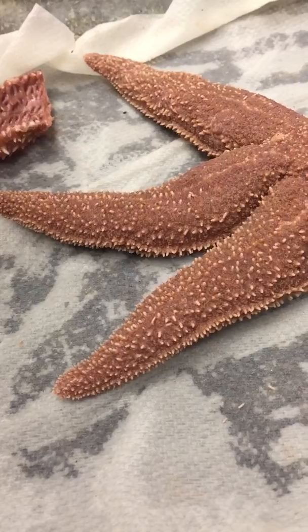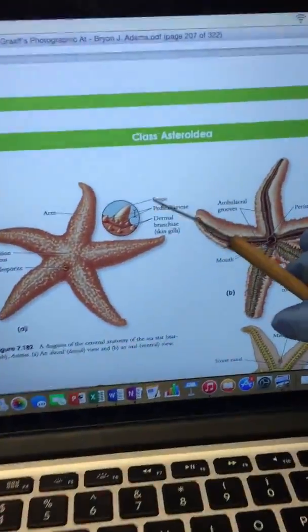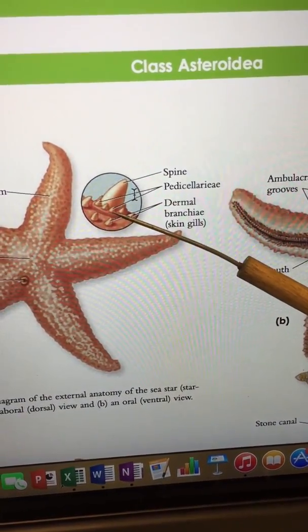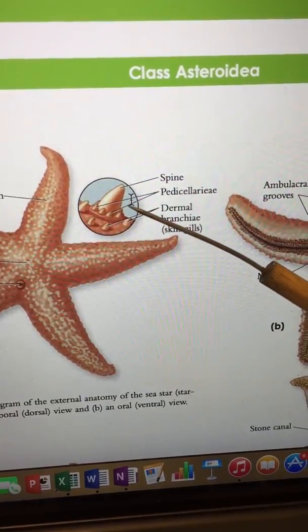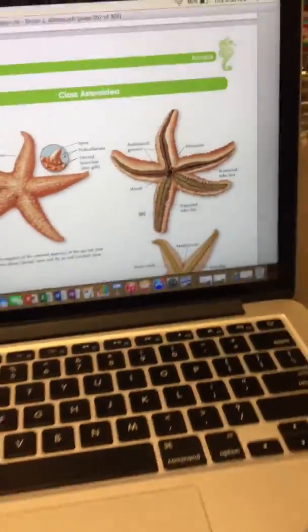The pedicellariae are the smaller spikes, you could say. What they do is they keep the surface clean. That's very difficult to see on the actual specimen.